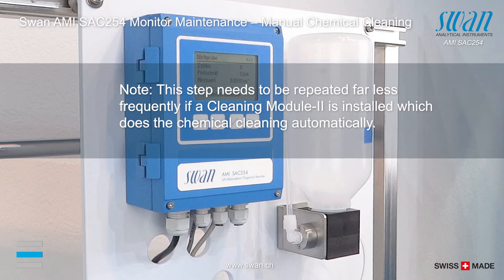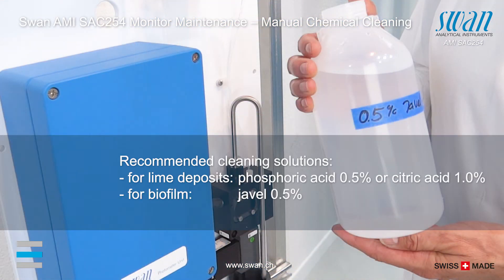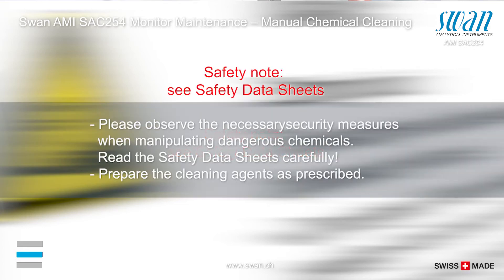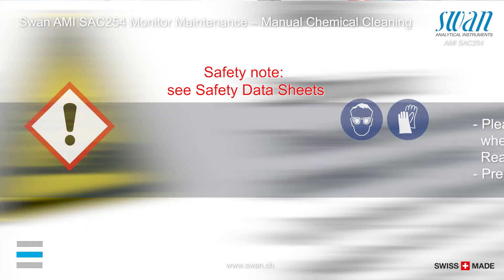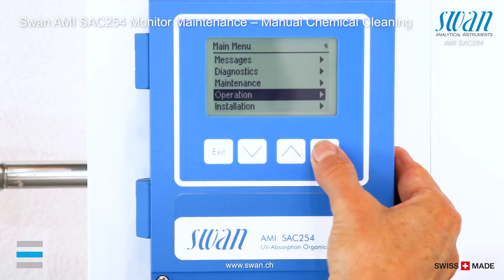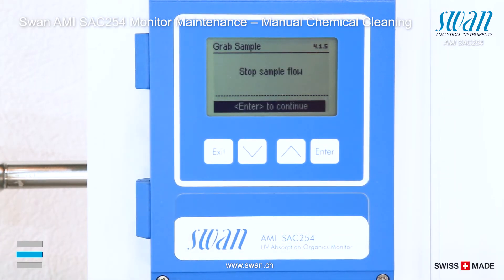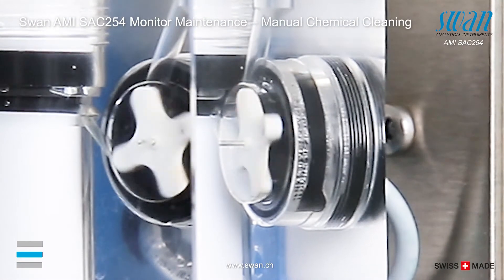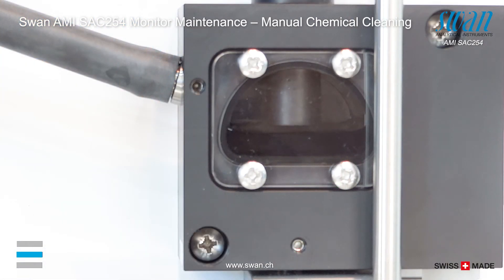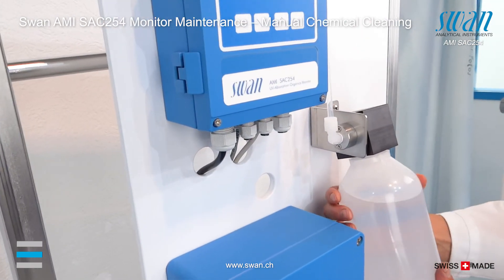The manual chemical cleaning has to be performed when necessary by using the grab sample function. Fill the cleaning solution into the grab sample bottle. Skip input of unit and sample ID by scrolling down and follow the instructions on screen. Wait until the system has completed the automatic drainage.